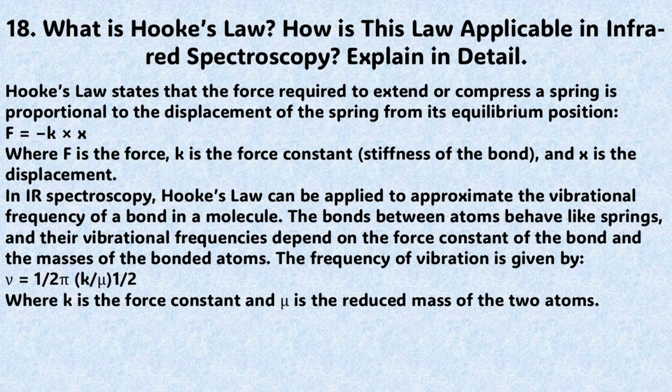What is Hooke's law? How is this law applicable in infrared spectroscopy? Explain in detail. The answer to this question is very simple. Hooke's law states that the force required to extend or compress a spring is proportional to the displacement of the spring from its equilibrium position. F is equal to minus k multiplied by x, where F is the force, k is the force constant related to the stiffness or the strength of the bond, and x is the displacement.